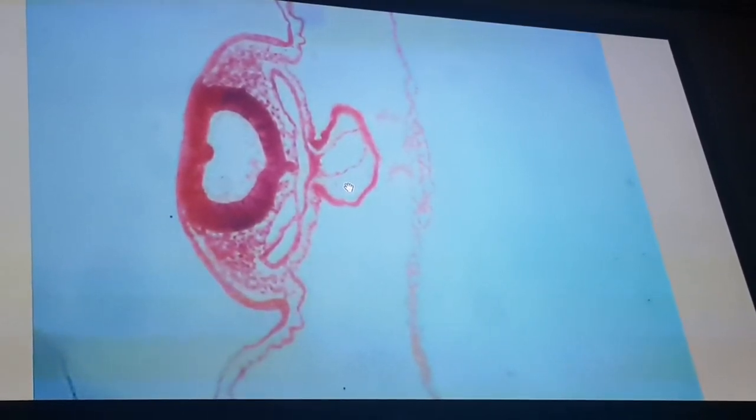In this section, also the first thing dorsally is the neural tube, which is here a brain vesicle. Ventral to it is the notochord. Ventral to the notochord are the wings of the pharynx and pharyngeal pouches, and then the heart. This is the single heart tube. Now it is completely fused, and you can see that the single heart tube is formed of three layers. First, the endocardial layer, which forms the lining epithelium of the heart. Then cardiac jelly, which disappears later on. Then the epimyocardial mantle, that will form the myocardium of the heart and the visceral layer of serous pericardium. So these are the three layers of the heart tissue.